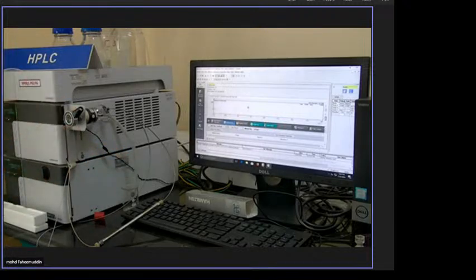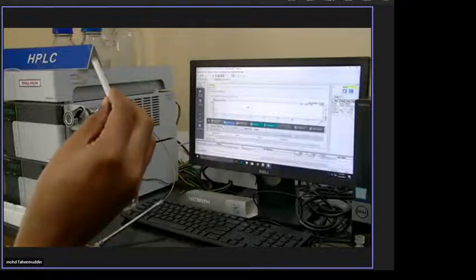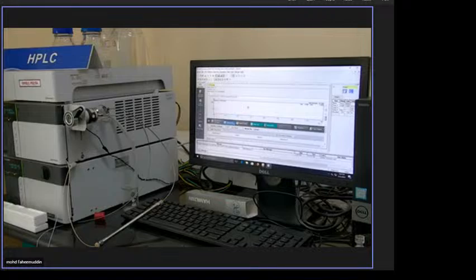Whatever the amount you are injecting, it's very difficult to inject exactly 1 microliter with a small syringe. So randomly we can inject it, but it will take only 1 microliter. 10 mg per 20 ml, 0.1 mg, 0.5 mg per ml.